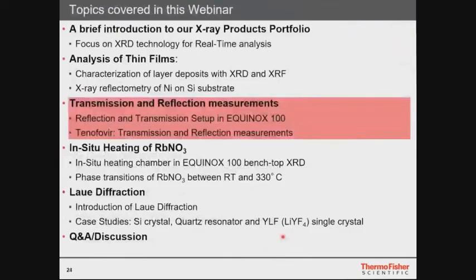The application is in situ measurements. Oh, sorry, it's transmission and reflection measurements. And I will show you an example of tenofovir, which is an anti-HIV drug.